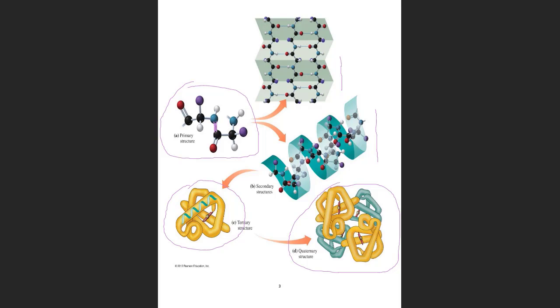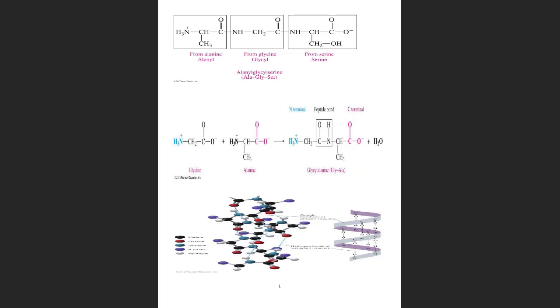The first thing you are going to do in the lab is denaturalization. What is denaturalization? It happens when a change, let me draw here. When a change, it can be a change in conditions.